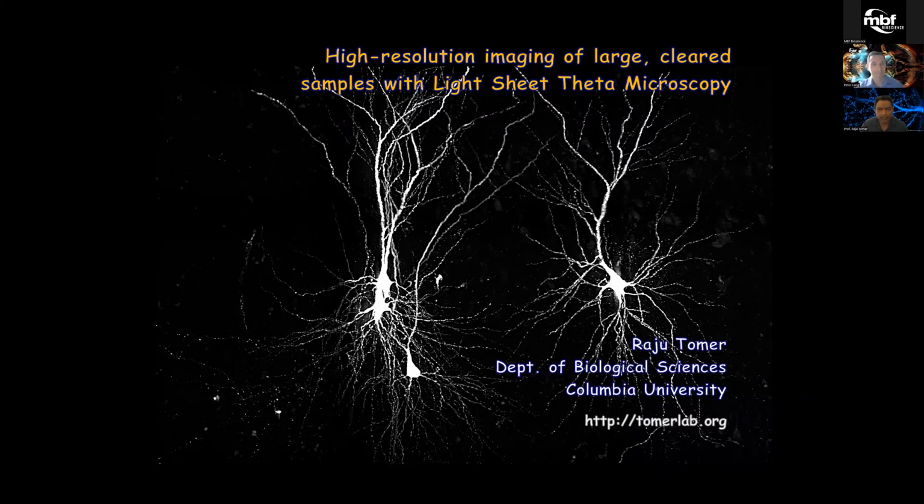So in this presentation, I'll generally discuss light sheet microscopy and its use for imaging large clear samples with high resolution, with a specific focus on the advantages that light sheet theta microscopy, this new implementation of the light sheet microscopy concept, provides over the conventional light sheet system for imaging much larger samples.